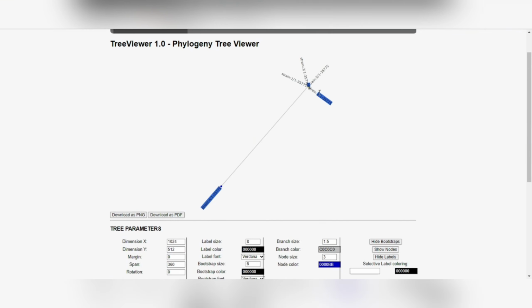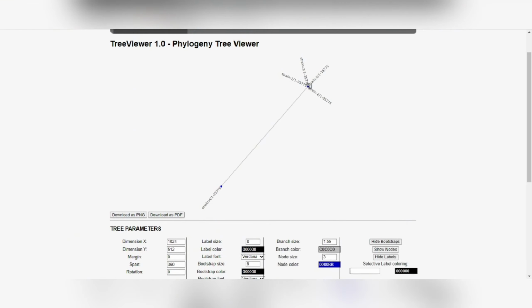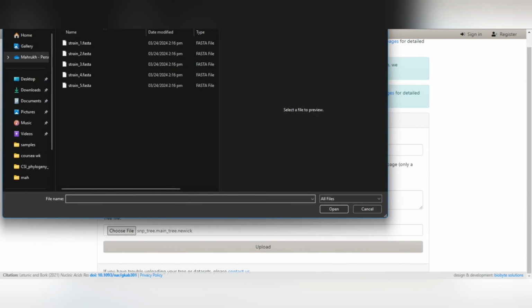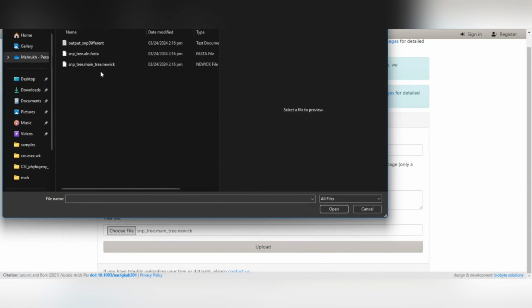You will see the difference between all the 5 strains. Here you can adjust the values to make the graph a little visible to read. Then we have another tool, where you can also do the same and upload all the sequence and then view the phylogeny tree.